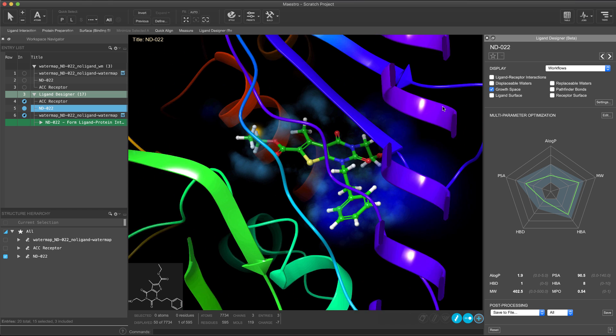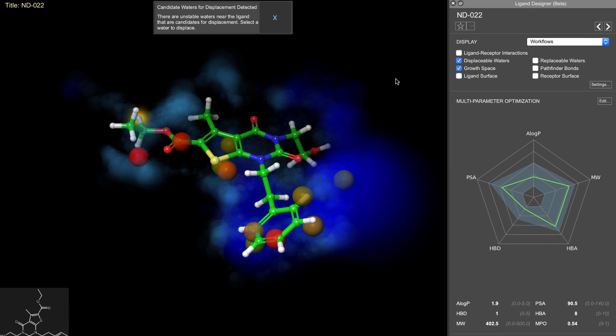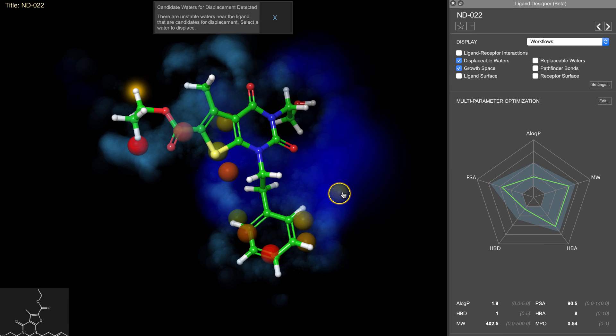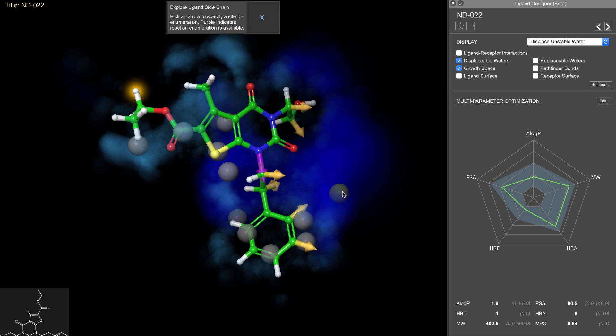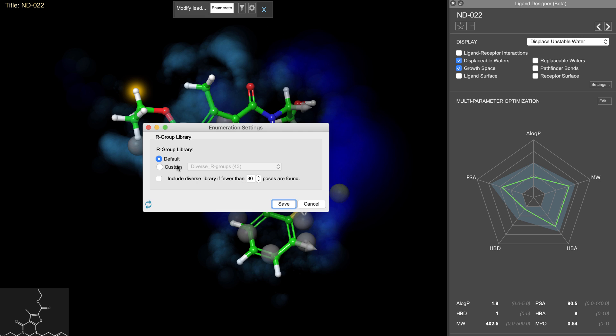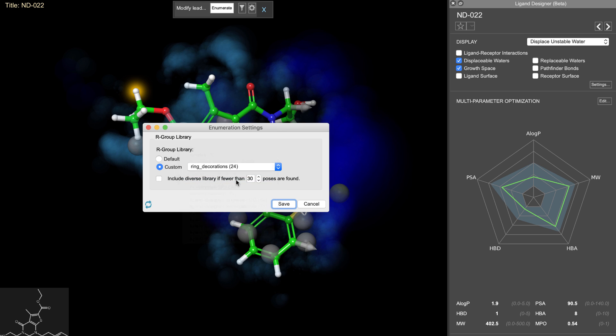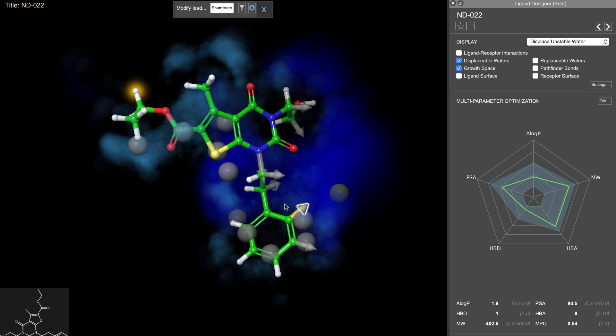Let's take another example. Here we'll select an unstable water map hydration site. Again, we'll choose from a series of possible vectors off the ligand to best displace the water. Notice that we can optionally choose a position further back, which would replace this side chain altogether. Now it's colored purple to indicate that if chosen, it will use Pathfinder's synthetically tractable reaction based enumeration method rather than the standard R group enumeration. However, we'll choose this vector instead. And this time, instead of using a default R group library, we'll change the enumeration settings to employ a custom ring decoration library.